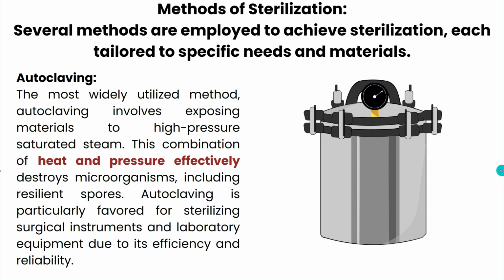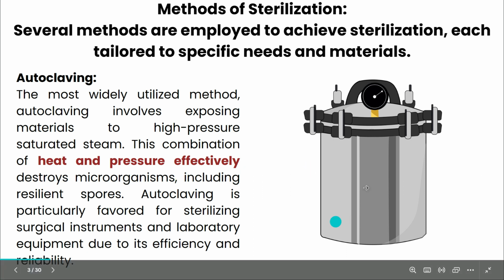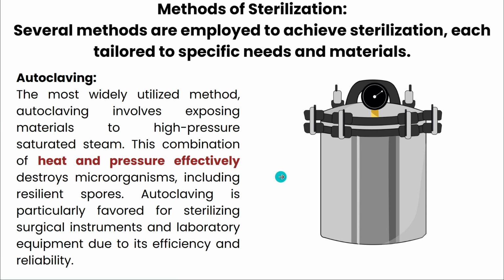The first instrument that we use is the autoclave. Autoclave is nothing but similar to a pressure cooker. Here, under the influence of heat and pressure, the microorganisms are destroyed. In an autoclave, we usually make the sterilization process very easy for glassware, media preparations, etc. So it is one of the handy instruments available in all microbiological laboratories, and this instrument is one of the fundamental instruments in the microbiology laboratory.